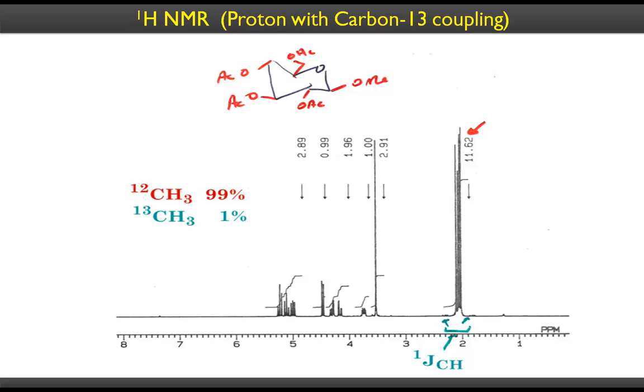it's very insignificant. In other words, if there are 100 hydrogens, only one of them would be on carbon, that is C13. So out of the 99 carbons would not couple with the hydrogen, only one carbon is coupling. So that would be very small amount of peaks and they would go into the noise.